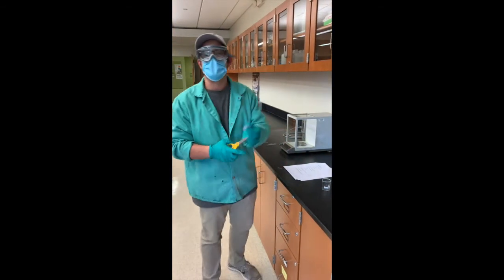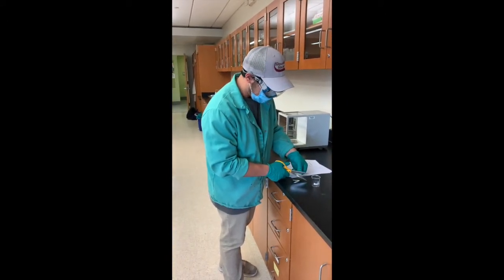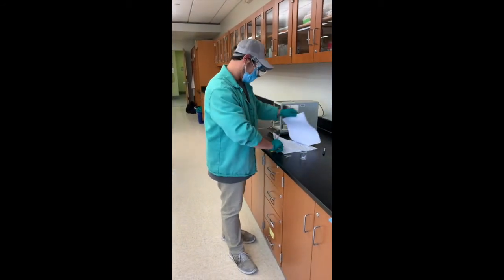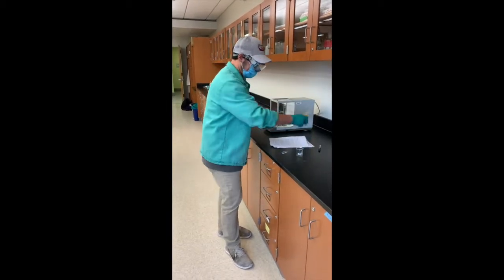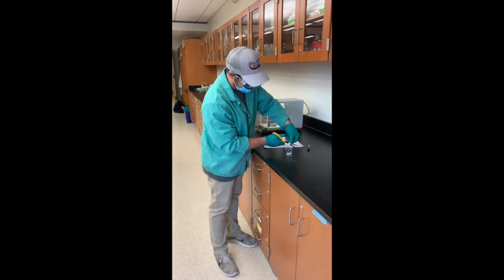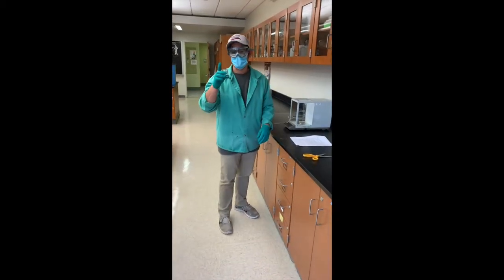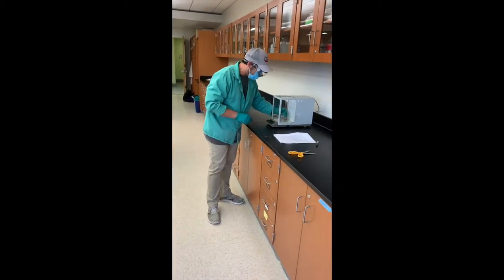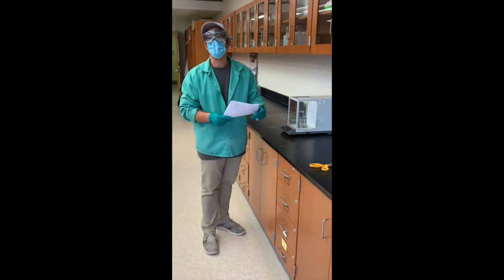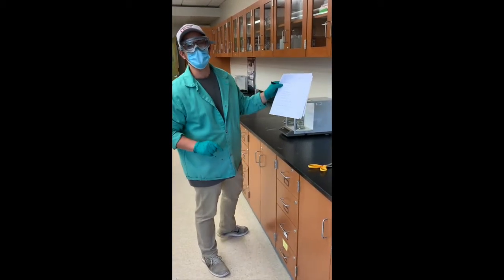You're then going to take your aluminum, which was sanded, and cut it up into a bunch of pieces in preparation for step 3. So I'm going to get this cut up and into my beaker. Once you've cut the aluminum into your little pieces, you're going to weigh the beaker again, and record that entry onto your results section as well. And that's the top, the mass of the beaker and the aluminum.